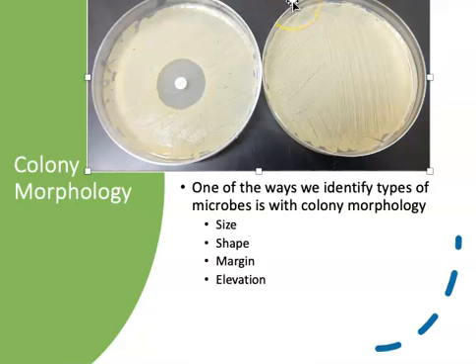Sometimes we grow lawns because they can be useful to us in the laboratory. For example, if you look over at this plate, it is being used to test these bacteria for antibiotic sensitivity. We haven't talked about antibiotics yet, or how we test bacteria to see if they are susceptible to certain antibiotics.